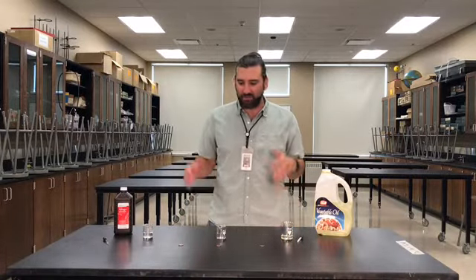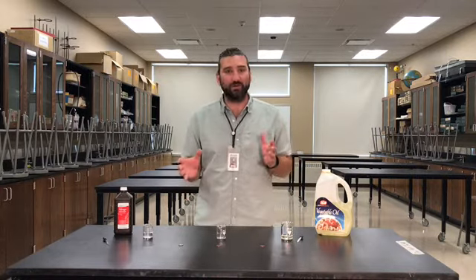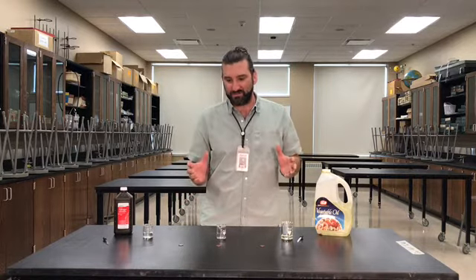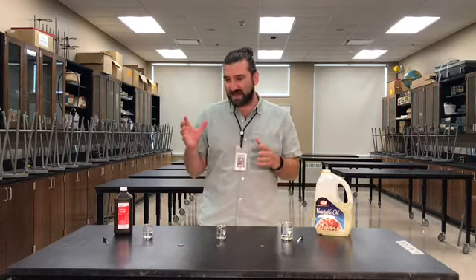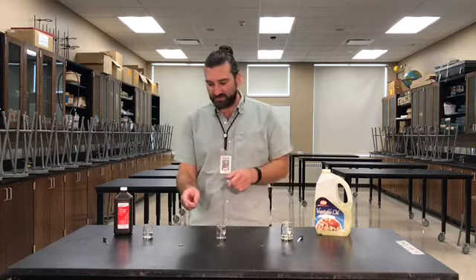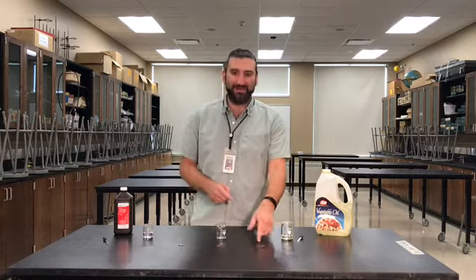I'm Mr. Nissen. I'm going to be walking you through the penny lab that we're going to be using this week to teach you about the scientific method. What we're doing in this lab is comparing the number of drops that we can fit of each of 3 different liquids onto a penny.